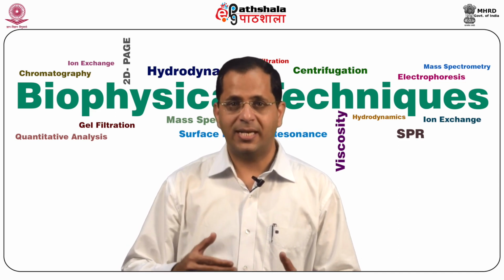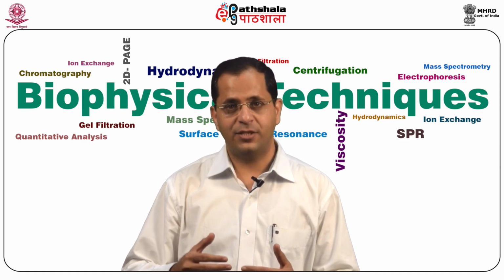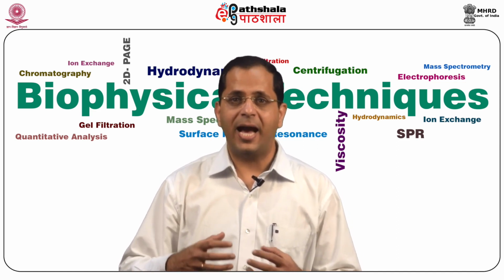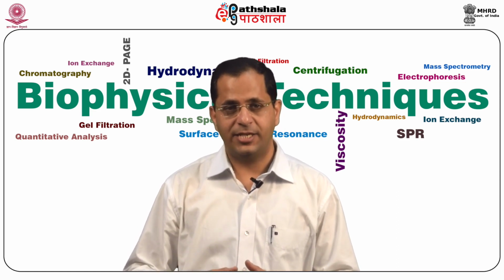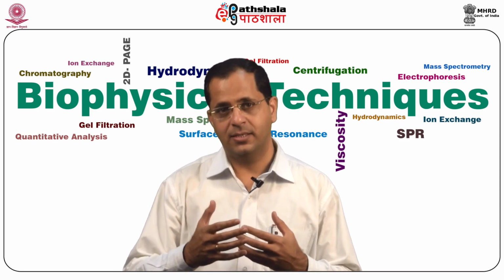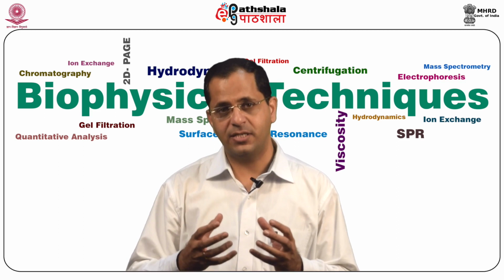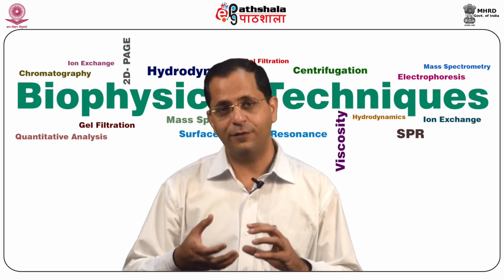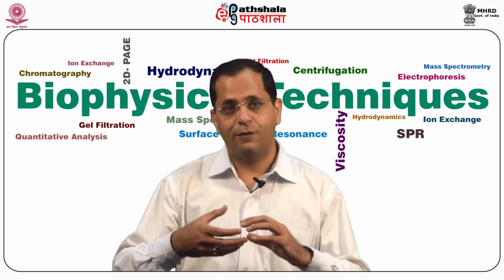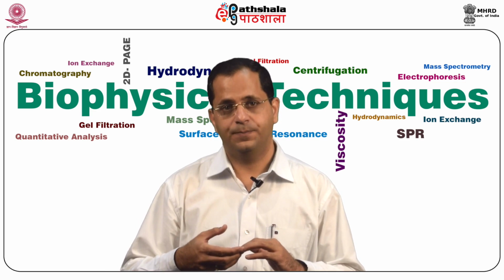Disulfide bridges are reduced in the first stage of equilibration, and the cysteine residues are permanently alkylated in the second stage. Therefore, proteins that are coming together at the end of isoelectric focusing and which have cysteines will now be prevented from forming disulfide bonds and thereby forming unwanted quaternary associations.